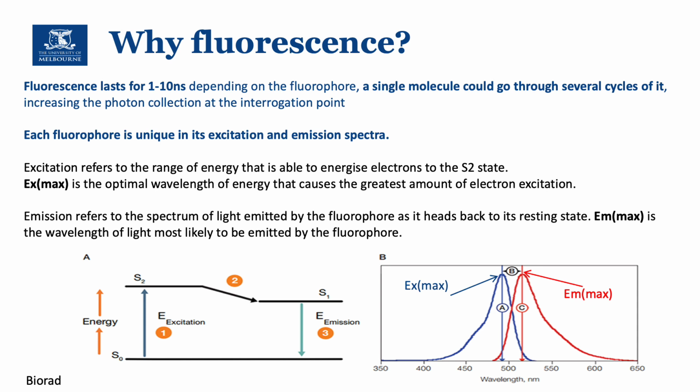Now, the speed of the interrogation does not lead, in most cases, to bleaching. So we don't have photobleaching as a main problem in cytometry. It clearly depends on the dye, but most of the time dyes crossing the laser are excited several times, and they can be reanalyzed, and the fluorescence is still there.